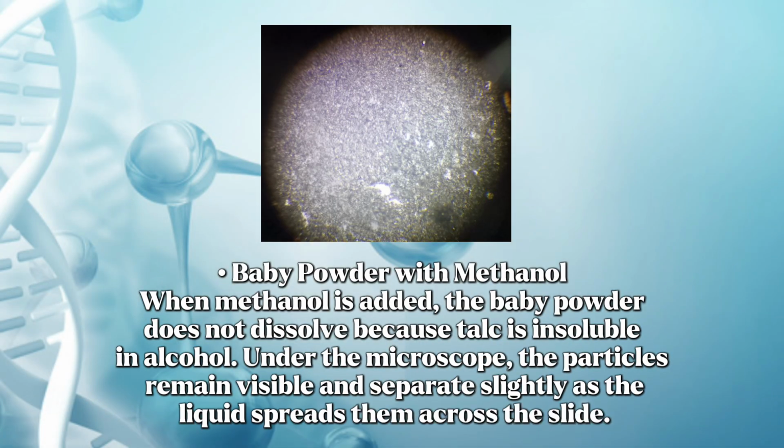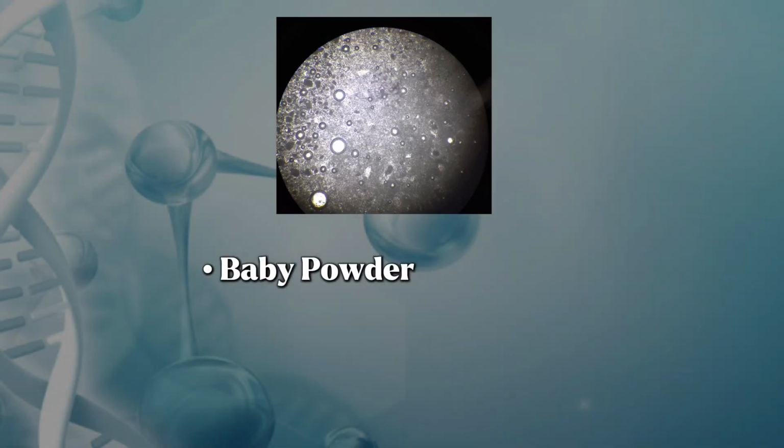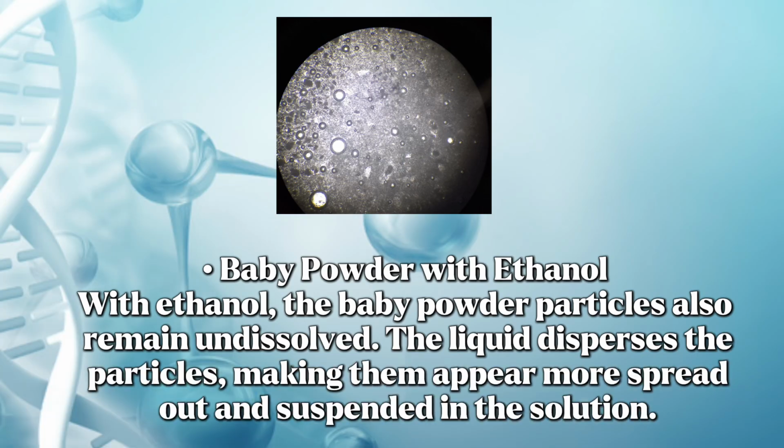Baby powder with methanol. When methanol is added, the baby powder does not dissolve because the talc is insoluble in alcohol. Under the microscope, the particles remain visible and separate slightly as the liquid spreads them across the slide. Baby powder with ethanol. The baby powder particles also remain undissolved. The liquid disperses the particles, making them appear more spread out and suspended in the solution.